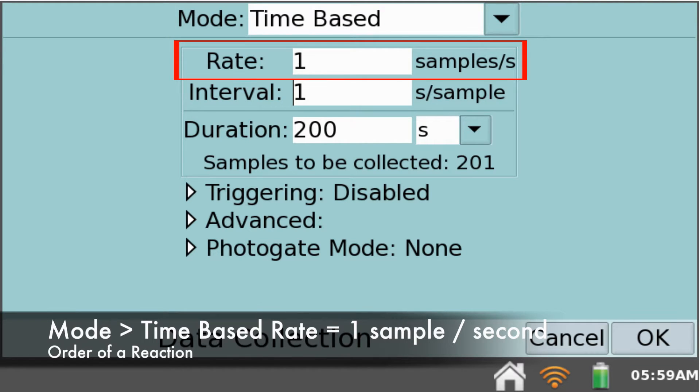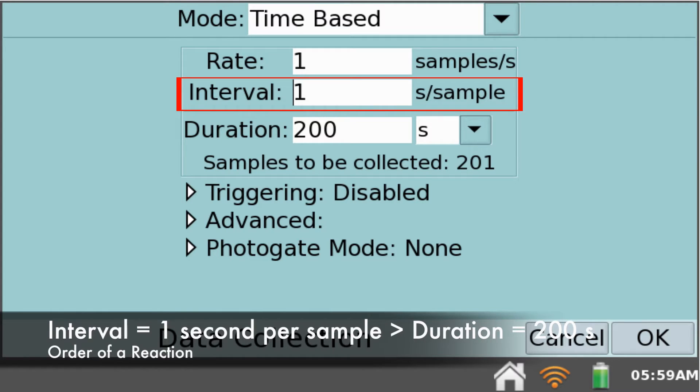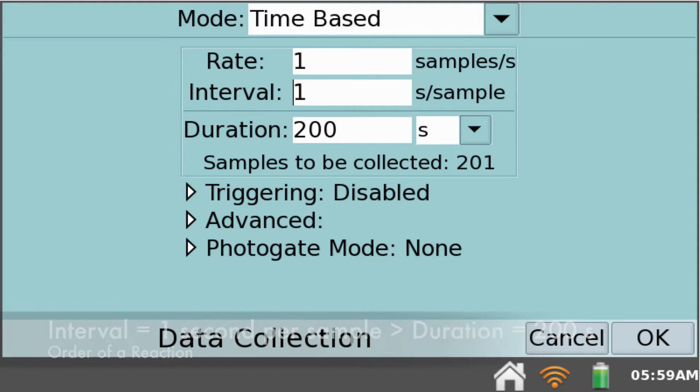Rate is set at 1 sample per second. Interval is set at 1 second per sample. And the duration of data collection is set to 200 seconds which is the default setting. Now you are ready for data collection.